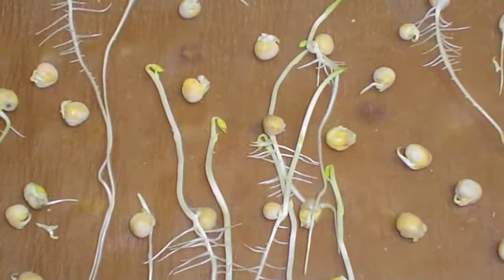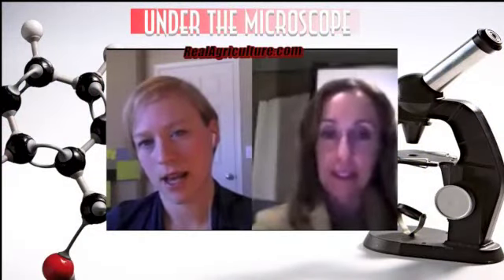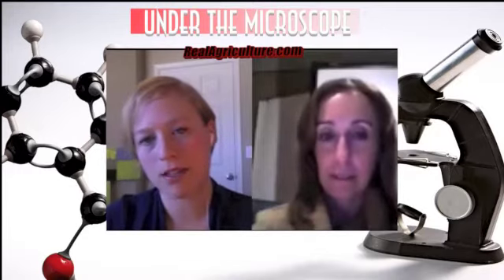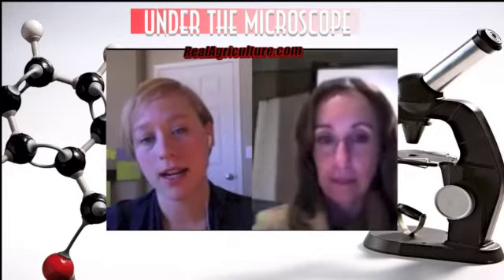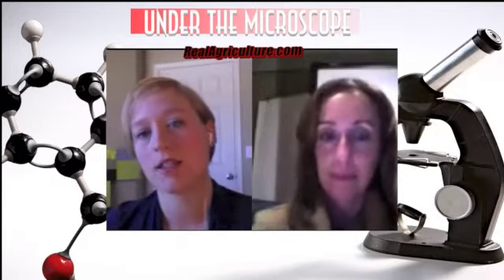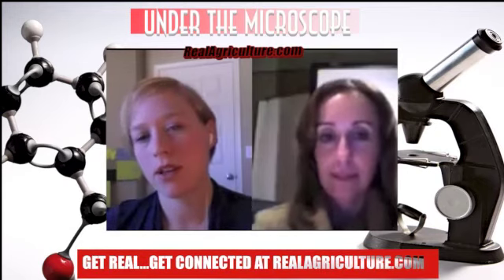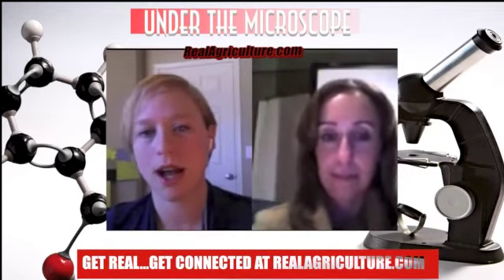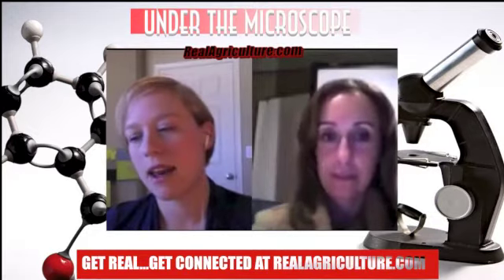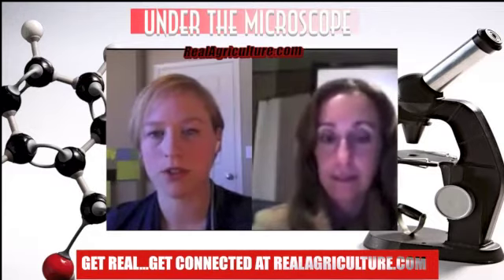Right. So again, producers looking at going in early, highly recommend a cool stress test. Yes, absolutely. And certainly, germ, as we've said before, is done under ideal conditions. So if you were going into very warm soil, maybe late in the season, germ is a great indicator. But for those going in early, really the cool stress test is going to be a more accurate estimate of germinating seeds. And then of course, there are several diseases that are an issue with pulses.